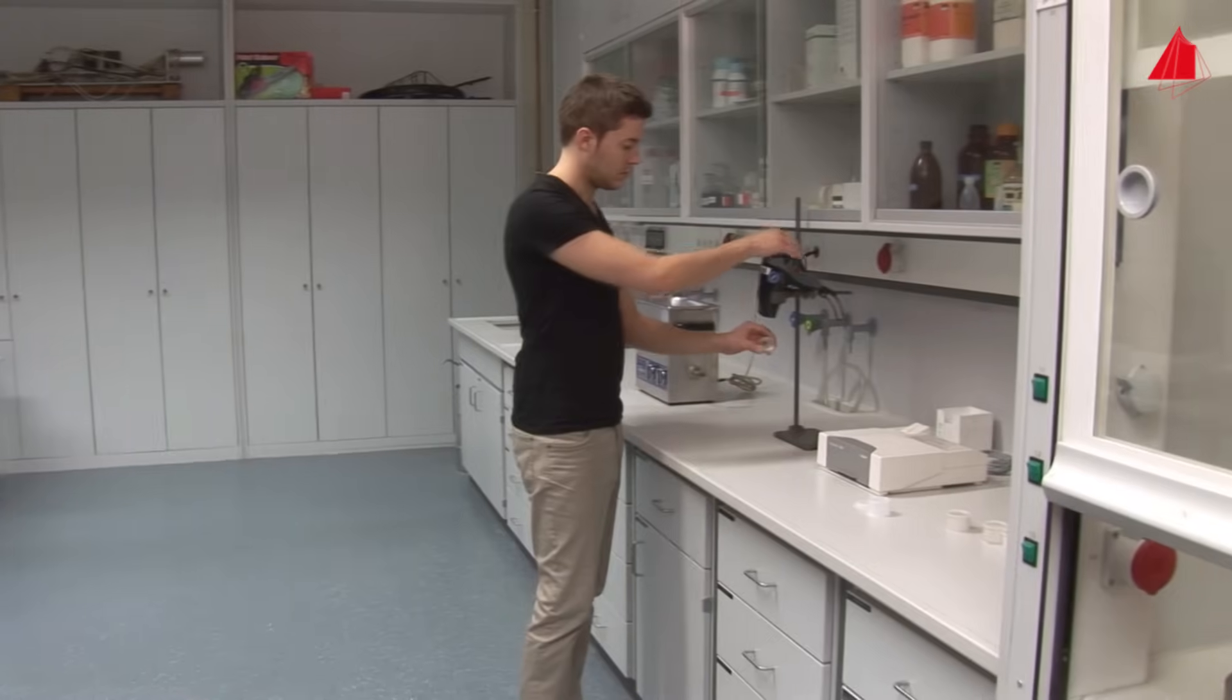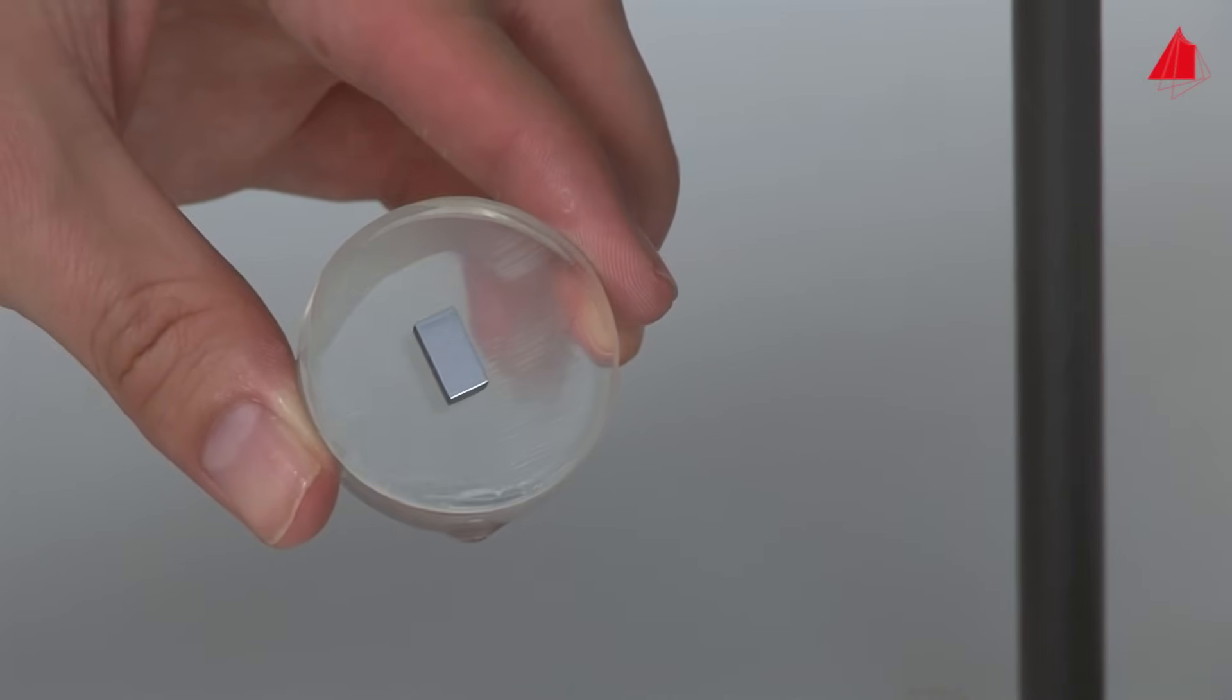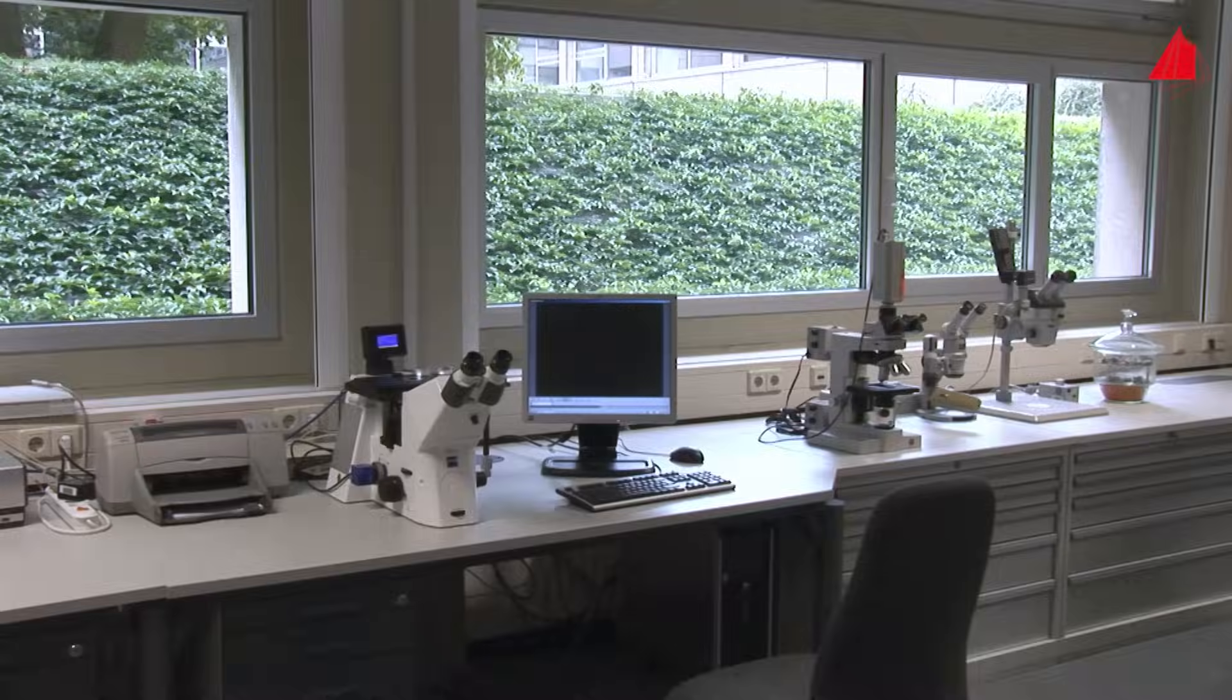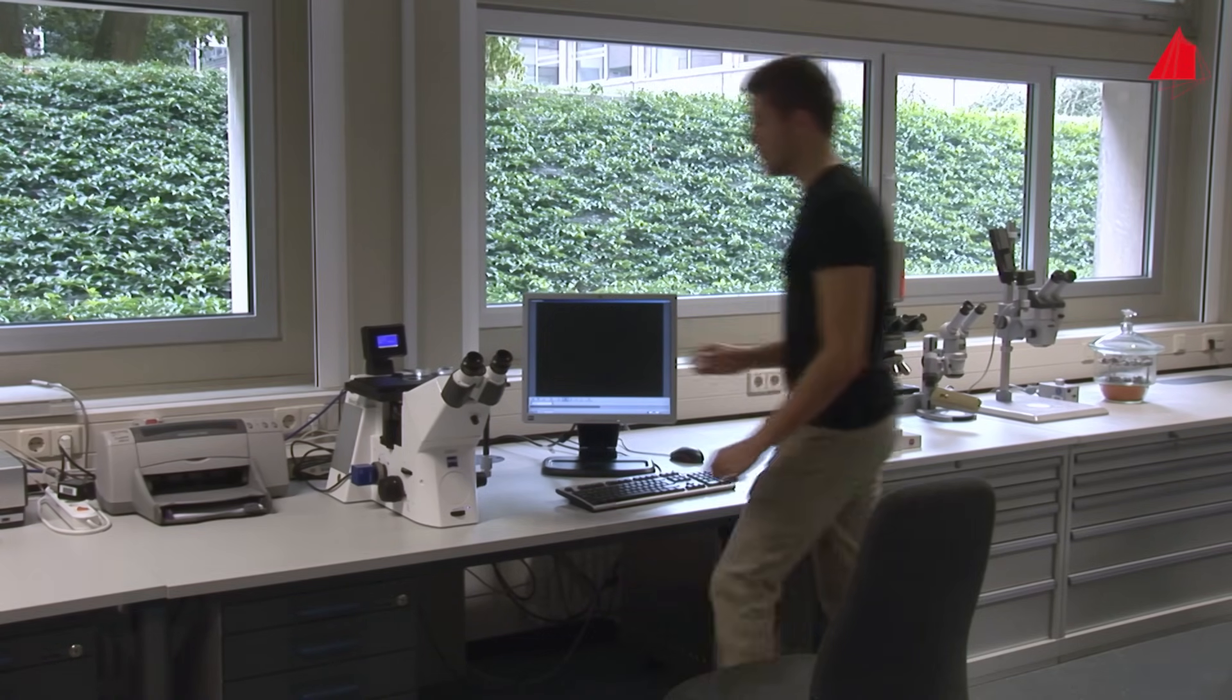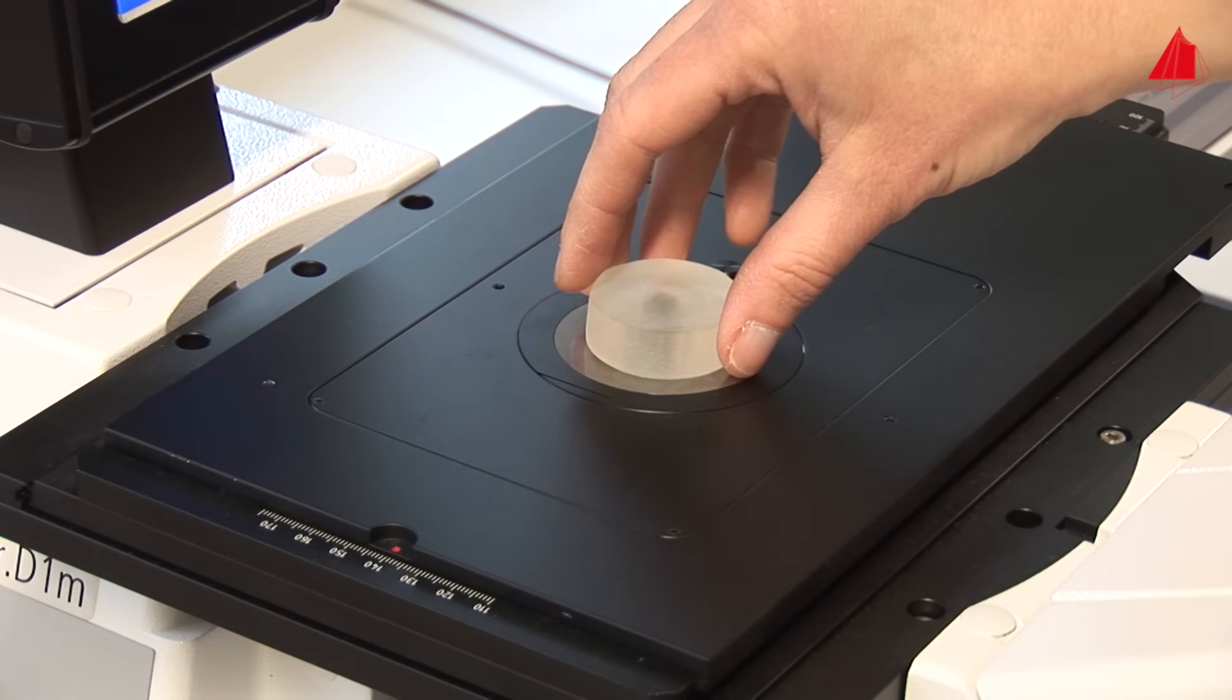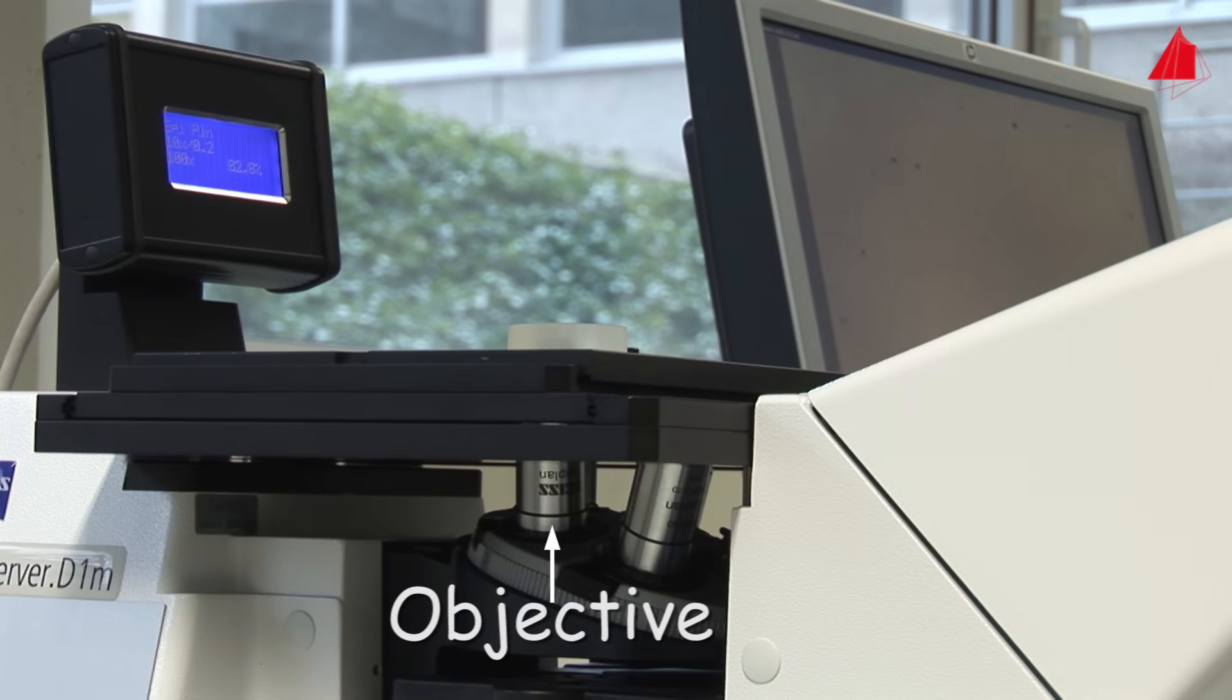From now on, the sample is called a metallographic specimen or micro-section. Judged with the naked eye, our metallographic specimen seems to be well prepared. It is now allowed to go under the microscope for the first time, or rather onto the microscope. In fact, the design of typical metallographic microscopes is inverted. Inverted means upside down. The microscope objective is not facing downwards as usual, but upwards. This offers the advantage of simply placing the metallographic specimen on top of the microscope stage. The prepared surface faces downwards.